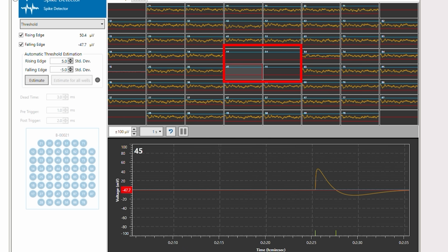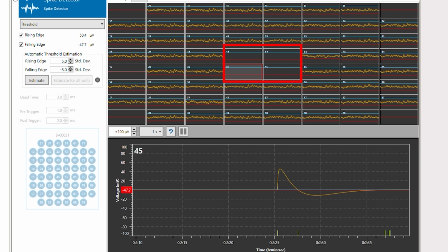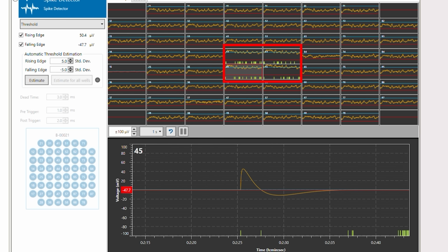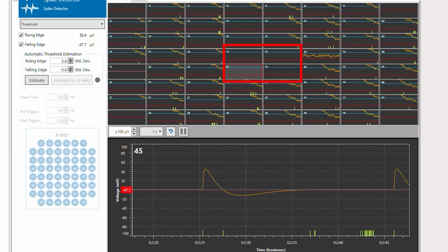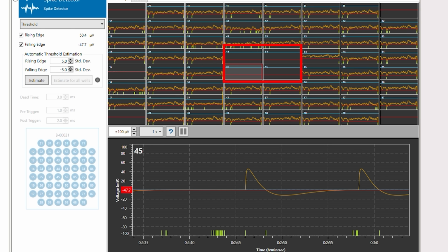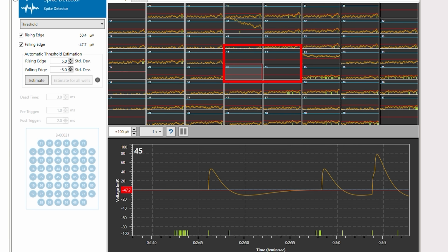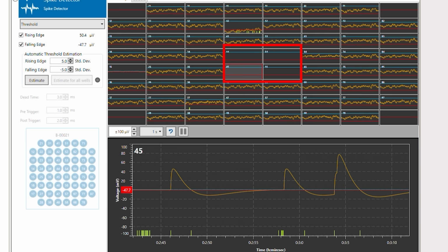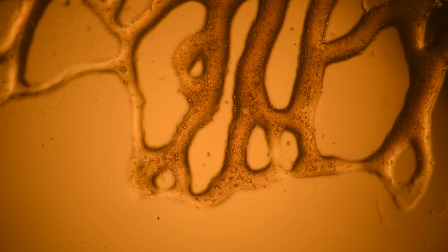When we fire the stimulation pulse, we see that suddenly the stimulated electrodes show a massive positive spike in voltage, which then swings negative before slowly coasting back up to normal levels. But the electrodes that weren't stimulated still show a reaction, and firing the stimulator multiple times can push the negative part of the pulse deeper. This looks like a fairly classical action potential, albeit a bit slow, so maybe slightly more like a muscle firing than a brain, but still.